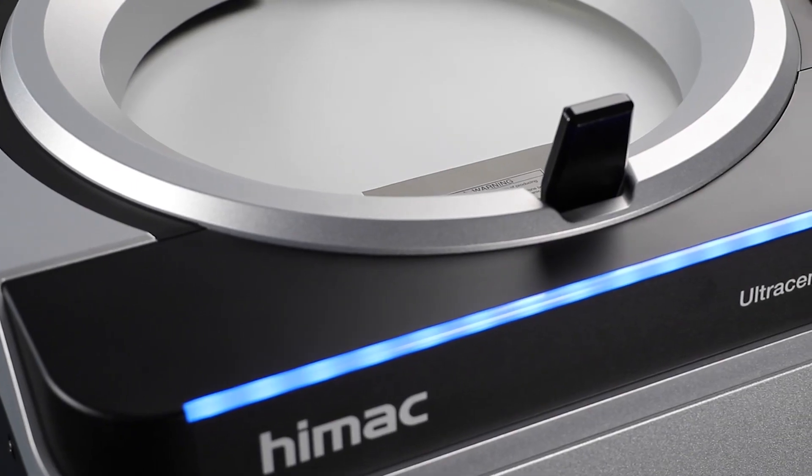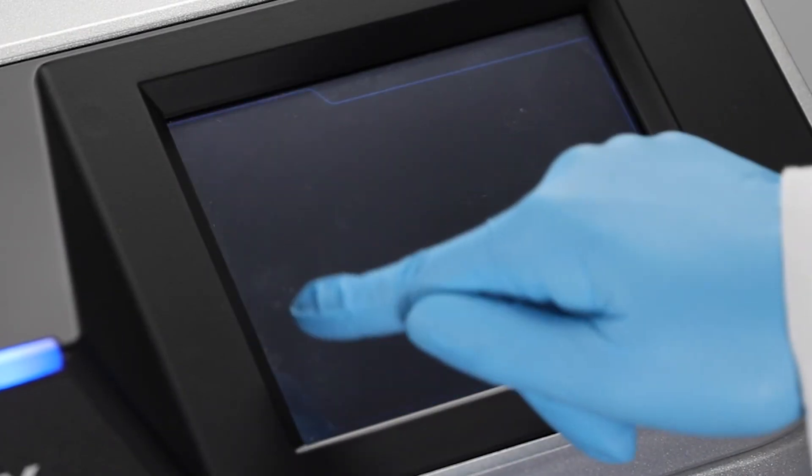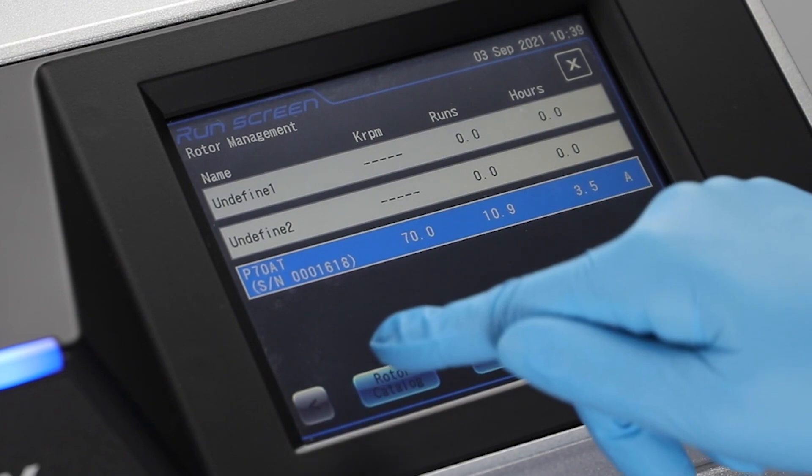The himac Centrifuge range is highly reliable, very high quality, and very easy to use. The differentiating factor against the competition is the Rotor Life Management system, which nobody else has. This essentially enables users of the centrifuge to know when a rotor is approaching its retirement date. The rotor itself stores the run times and run speeds, and adjusts the lifespan of that rotor accordingly.